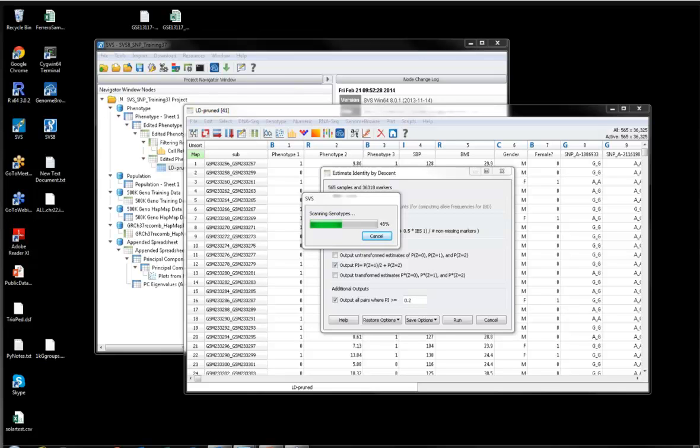We also have our own plugin that works with the Illumina Genome Studio software. So if you're using Genome Studio to get your variants or your genotype calls, you can use that plugin to export the data out of Genome Studio directly into our preferred formats. Then also, we support import from a variety of other what we call third-party formats.